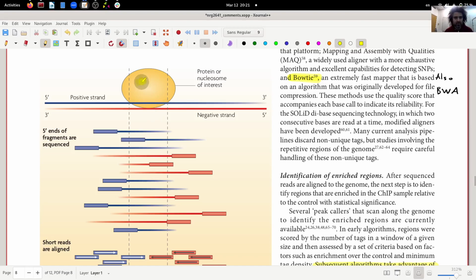So let's suppose that this is TAL1. Now, since we have put an antibody here and we have precipitated this thing, and we have also used sonication to cut the DNA, perhaps we cut it here and we cut it here, which means that there is a fragment like this one.